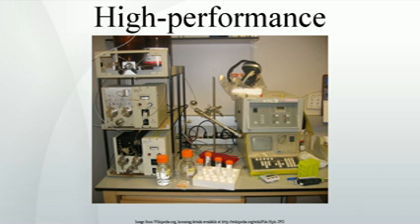Normal phase chromatography. Normal phase chromatography was one of the first kinds of HPLC that chemists developed. Also known as normal phase HPLC, NPHPLC, this method separates analytes based on their affinity for a polar stationary surface such as silica, hence it is based on analyte ability to engage in polar interactions, such as hydrogen bonding or dipole-dipole type of interactions, with the sorbent surface.